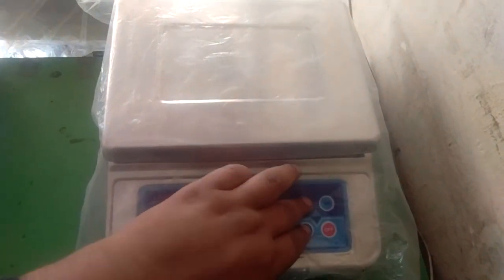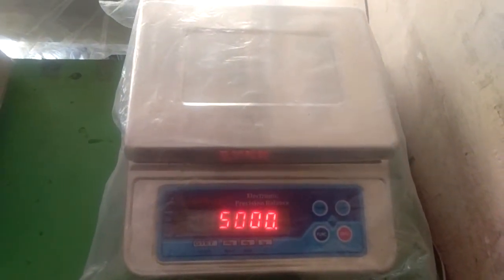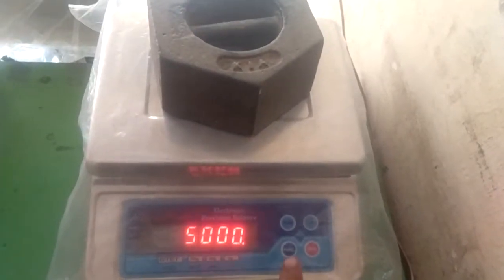Then press function and tear simultaneously. We get 'cal' on the display, then 5000 — that means we have to put a 5kg weight over this. Let me put it on.